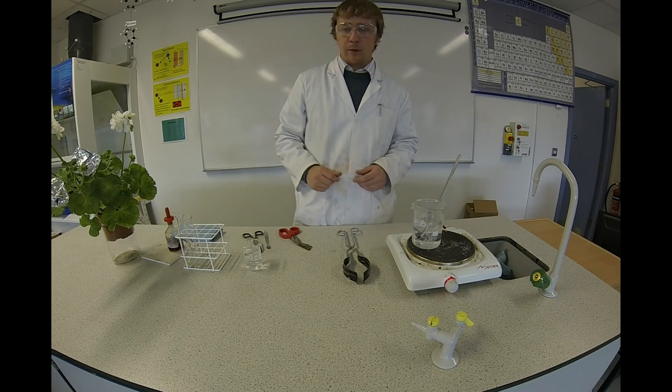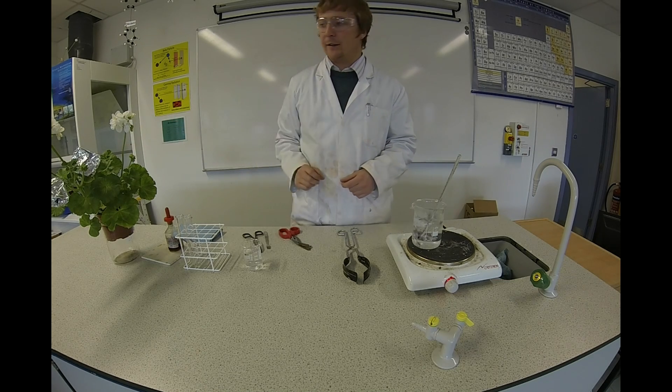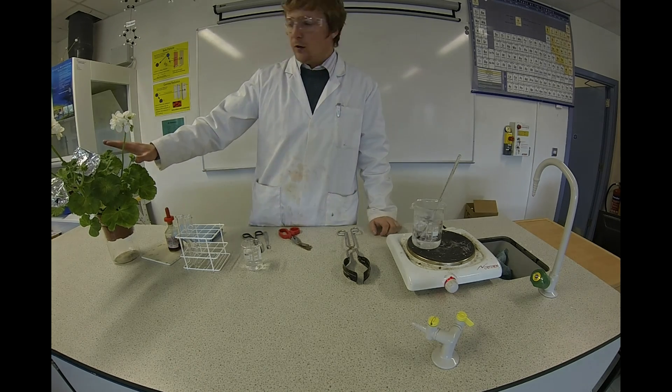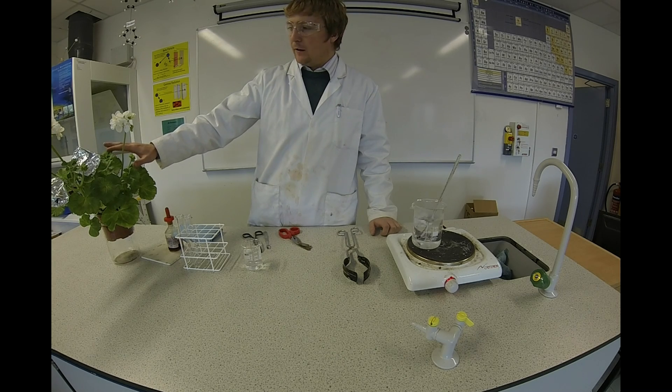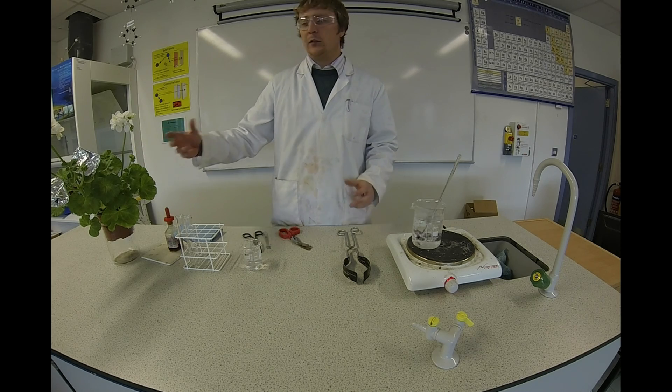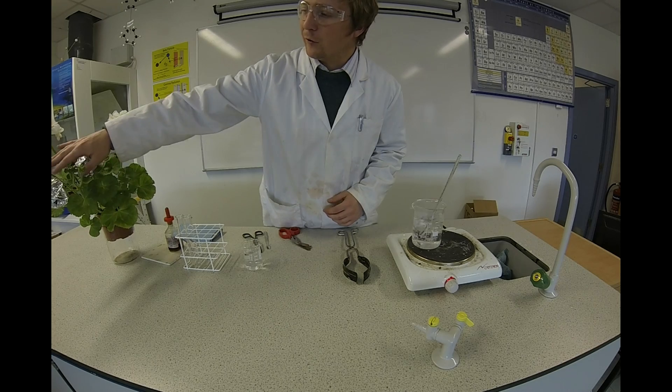Now the first thing I'm going to do is explain the preparation that's gone into the plant. I've put this plant in a dark room for two days. What that does is it removes all the starch from the leaves. I then took it out and covered a couple of the leaves with tin foil.